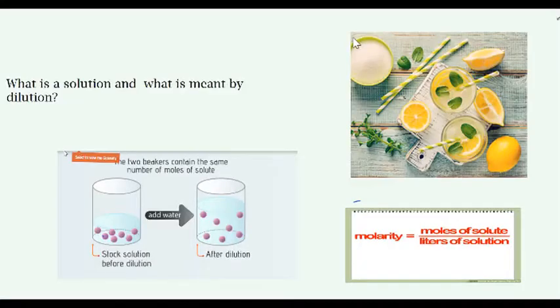We will go through the pre-lab and the data collection and the majority of the parts of the lab together. As we go through the video, you'll fill out your lab template. After we analyze the data together, you should be ready to do those conclusion questions on your own. So you'll fill those out and then you'll upload the document as normal. And then you're done. So let's get started. Let's work through the pre-lab questions first.